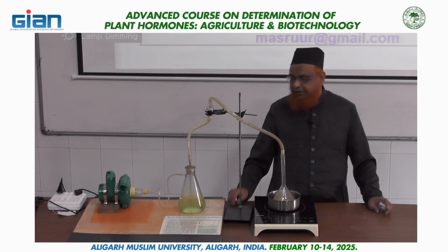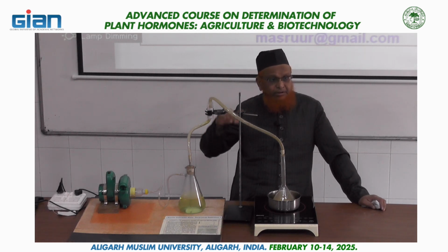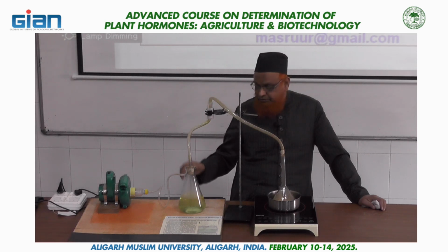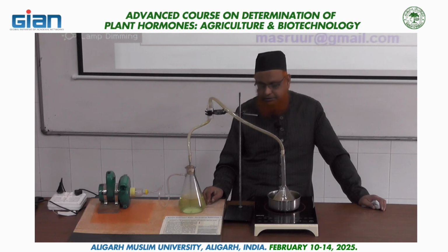Okay, you have to take a sample after each 5 minutes. Keep on taking optical density. When you find saturation, stop it, because no more smoke will be dissolved in this water, and it is fully saturated. Now you can use it after diluting it 1 to 1000, 1 to 500, 1 to 250, 1 to 100, etc. Right? Clear?